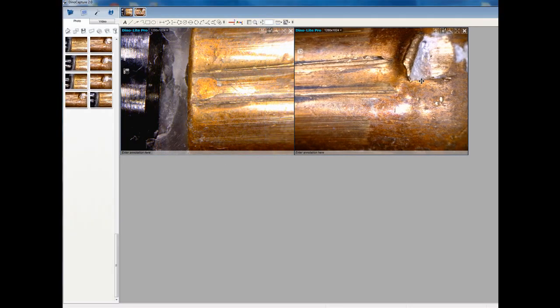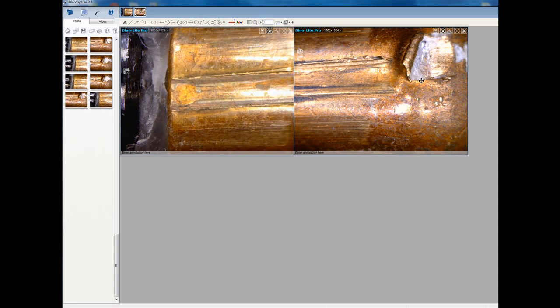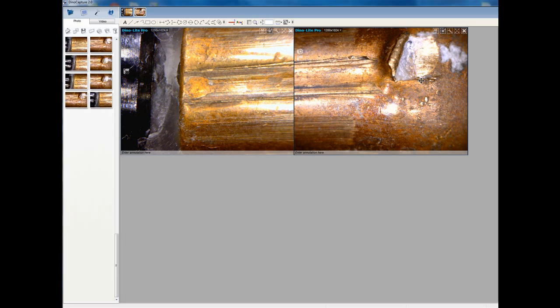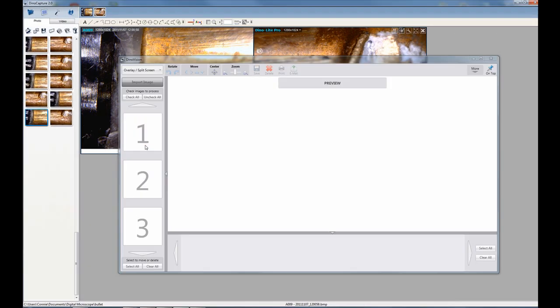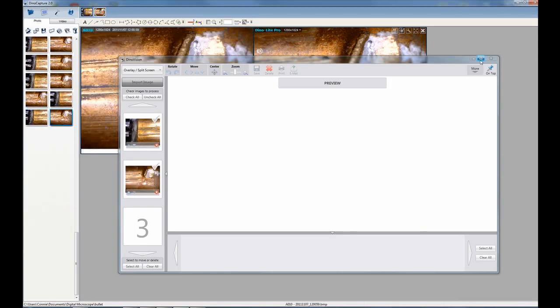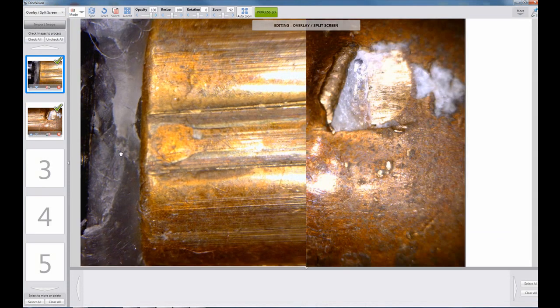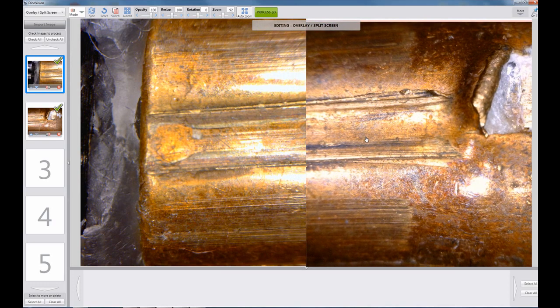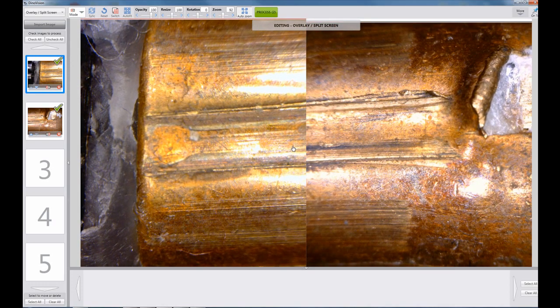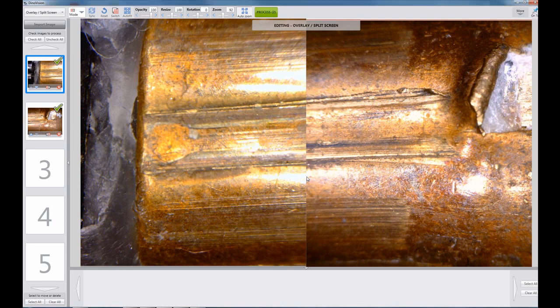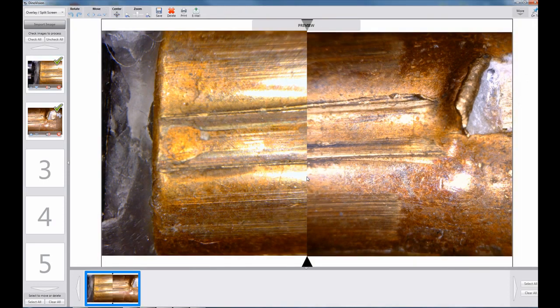The DynoCapture software has native comparison features. Here are the two live images of bullet comparisons examining lands and grooves. After capturing the images, one can transfer images directly into the DynoVision software, taking advantage of the overlay split screen feature to positively identify and document a match. Here, creating a final single image.